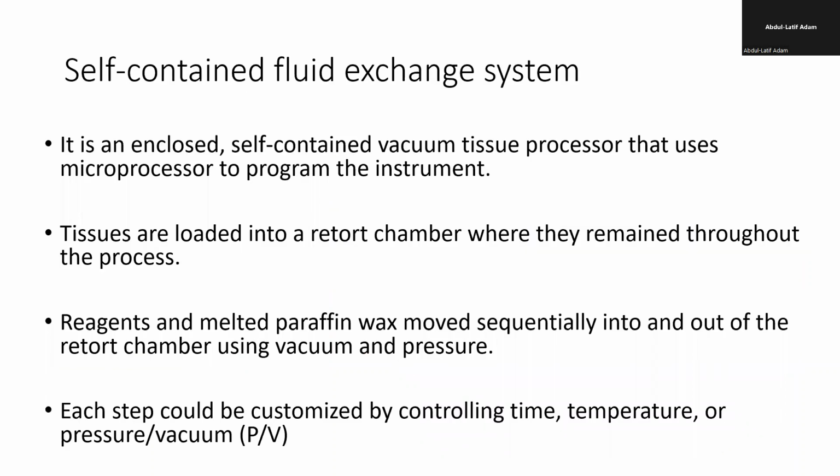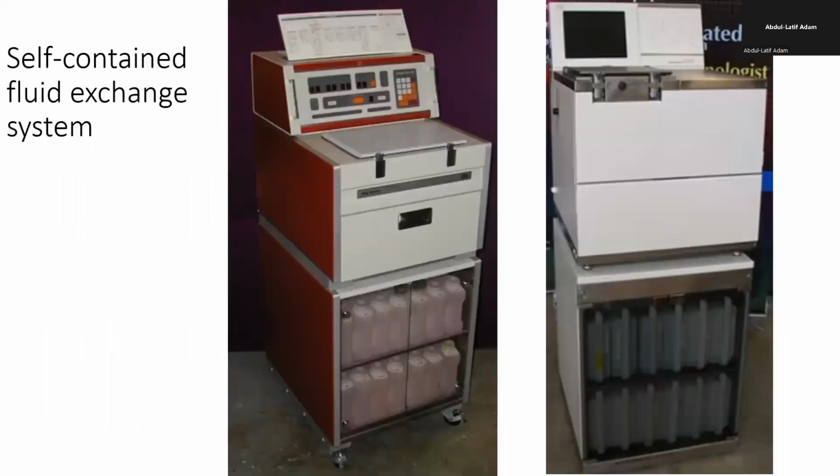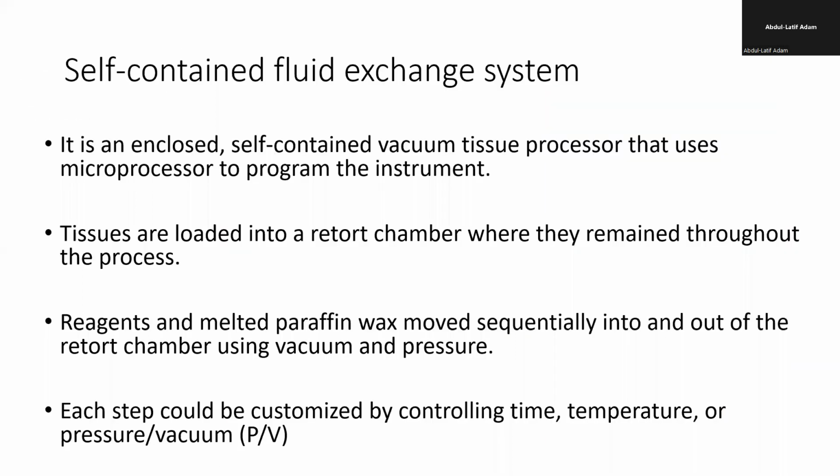So I've explained this already. And one interesting aspect of this automatic processor is the ability to create vacuum. Vacuum also enhances penetration. So these automatic processors have vacuum.